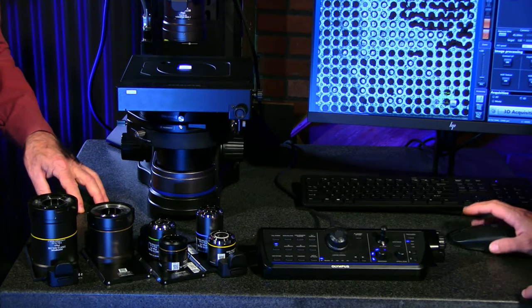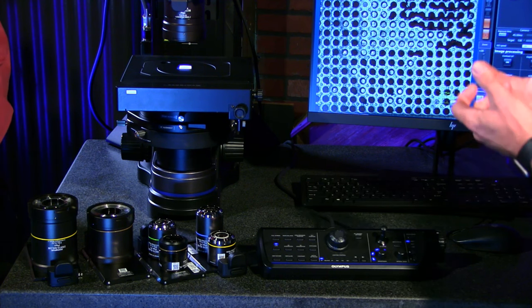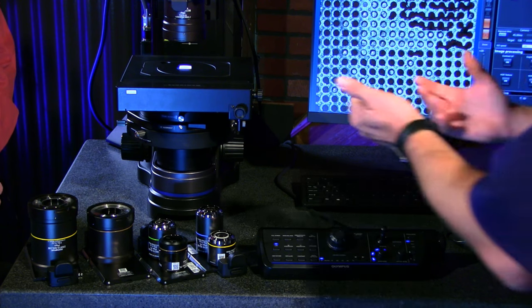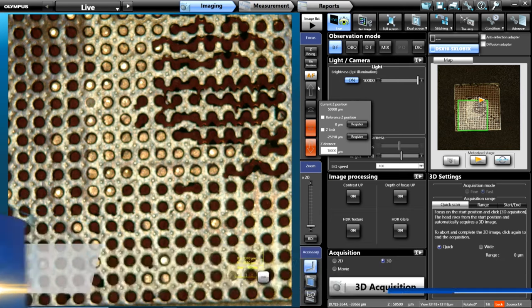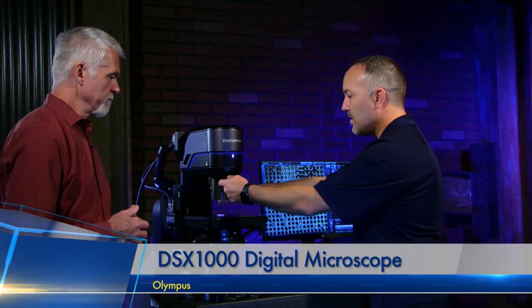Once you set up your sample and basic setup, you can be pretty much hands-off on the microscope itself. If I want to take a closer look, I can just reach over to the microscope. Before I do that, I'll put the software into what we call Z-rising, where it moves the head up and further away from your sample so you don't have to worry about hitting anything. There's a button on the front here and the objective just slides out. The objective lens can be stored in a storage container box that keeps them sealed.